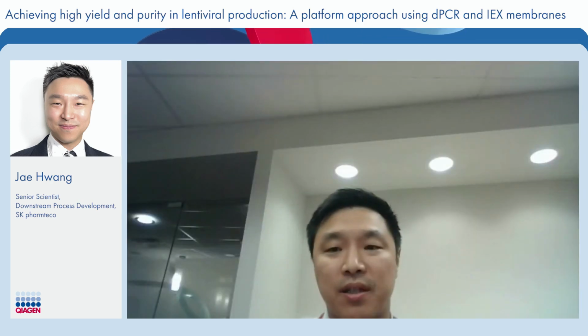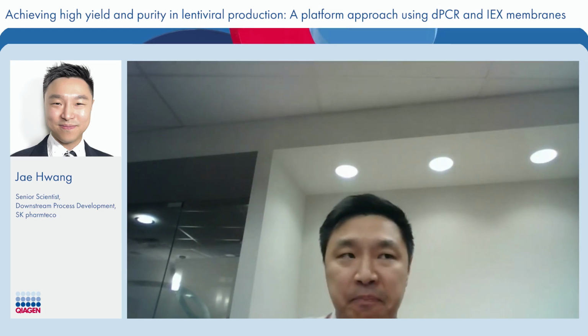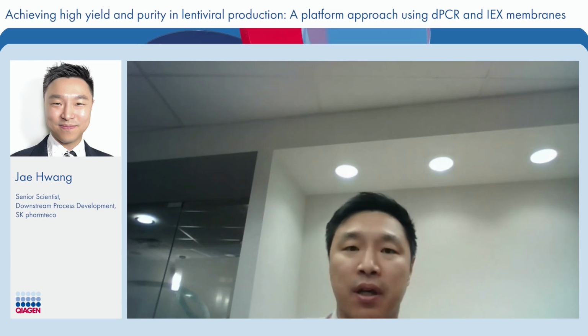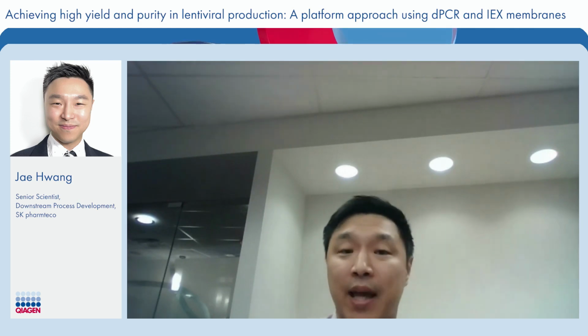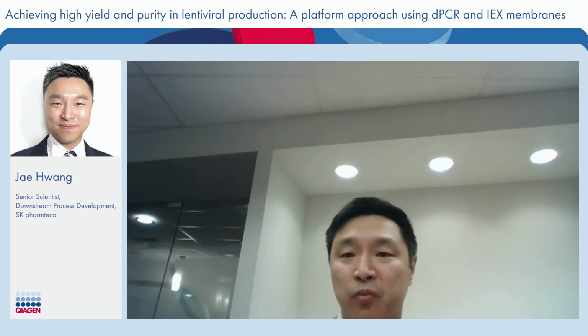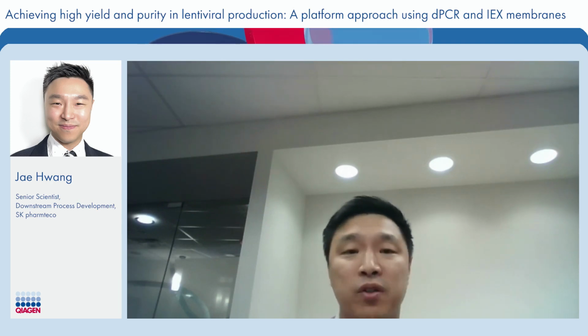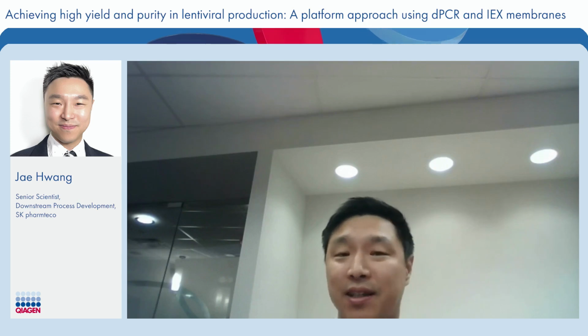That's actually a very good question. So the temperature is one of the key things to consider when it comes to the downstream processes. Initially we try to process everything in one day, hoping to get the best recovery possible. The slide that we shared today at the 50 liter scale can definitely be performed within 6 to 8 hours. But we also found out later that the process can actually be held overnight at 2 to 8 degrees C and then processed the next day.